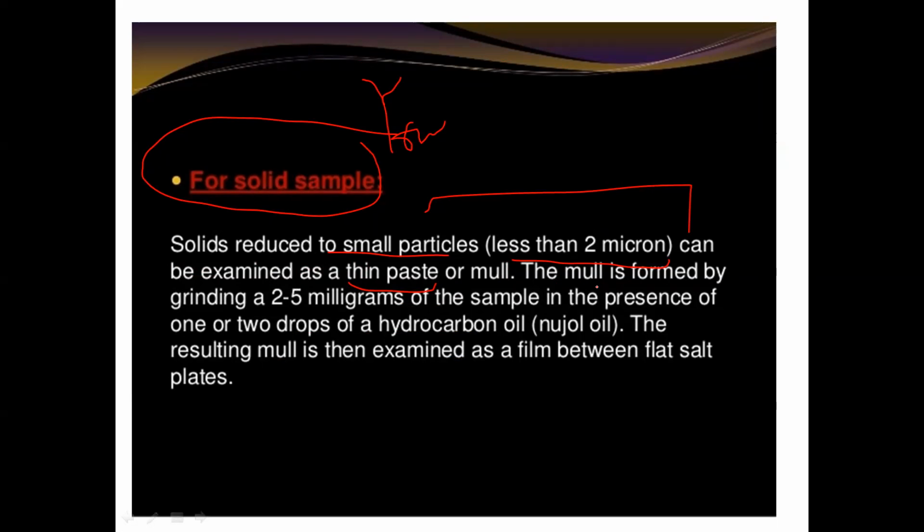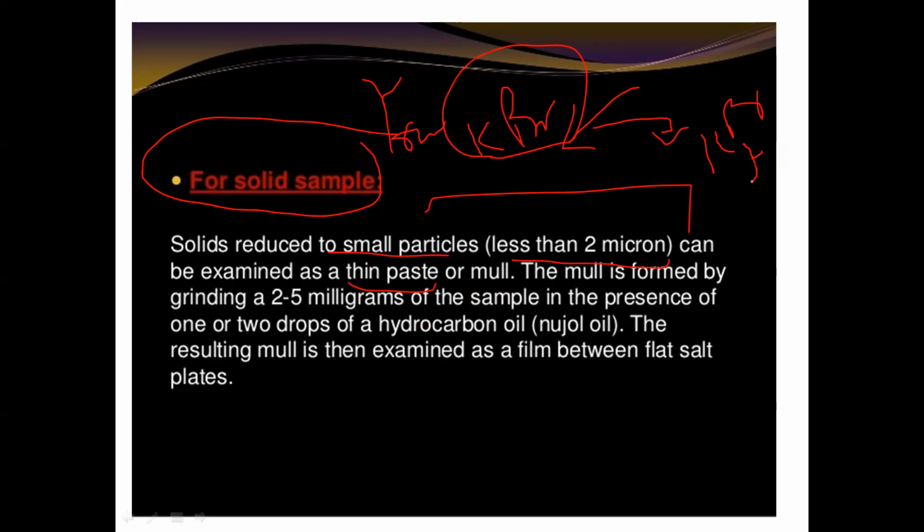After that, you will use KBr, and in KBr you will mix the sample. The sample and KBr will be mixed, and you will form the pellets.